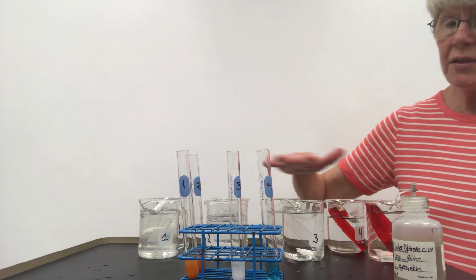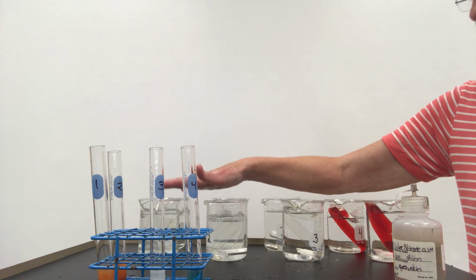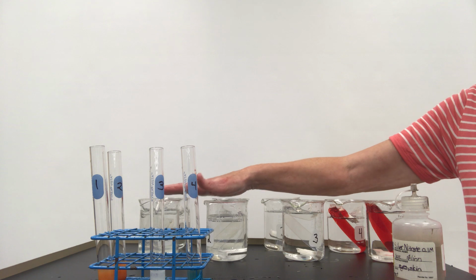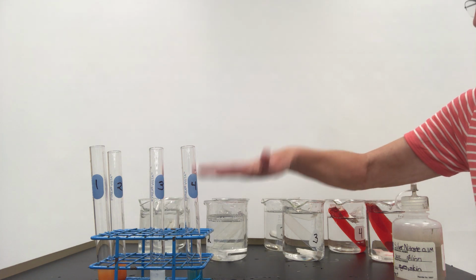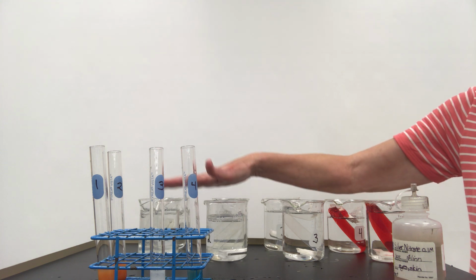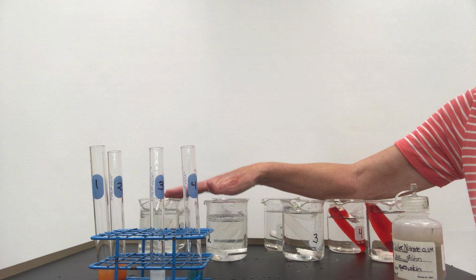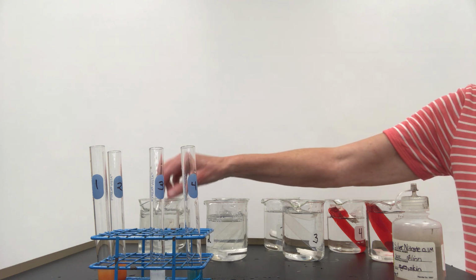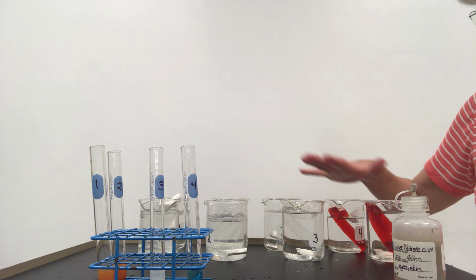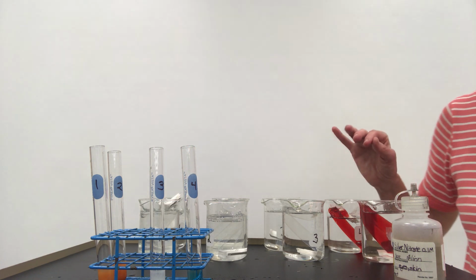So the net result of this experiment is that, one, when we put them in a hypotonic solution, there will be osmosis of the water into the sac. And the second thing is that the Benedict's solution, to indicate whether or not the sugar moved out, was positive for the beaker solution when we had glucose in the sac, but it was not positive when it was sucrose in the sac, because sucrose is too large to move.